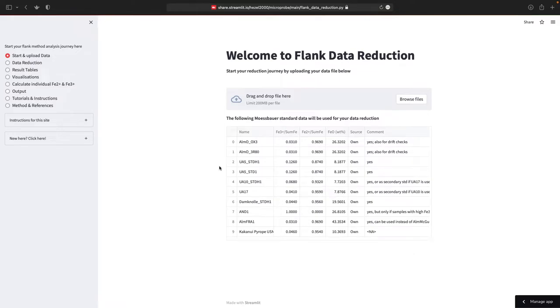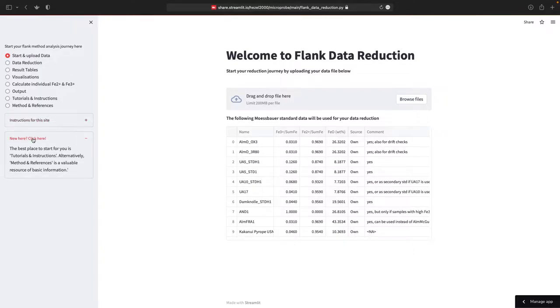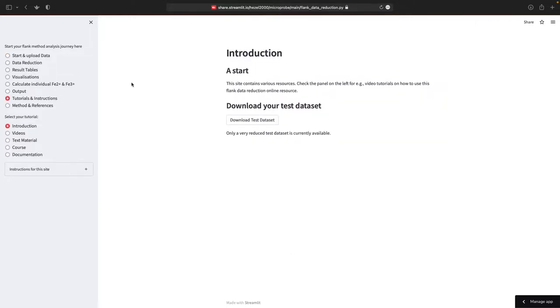Once you have prepared your file, you can navigate to the Flank Data Reduction website and start analyzing your data. Here on the left there's a navigation pane and a small pane which directs you to tutorials and instructions. You can download a test data set, though it's currently not working - these things will be rectified soon.